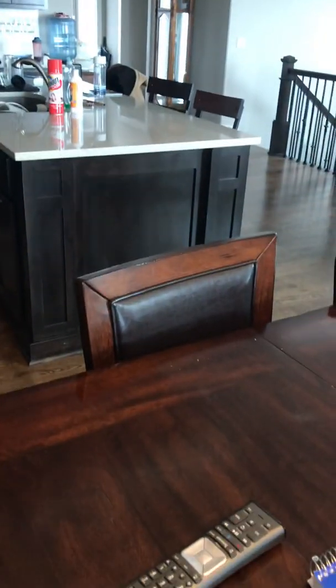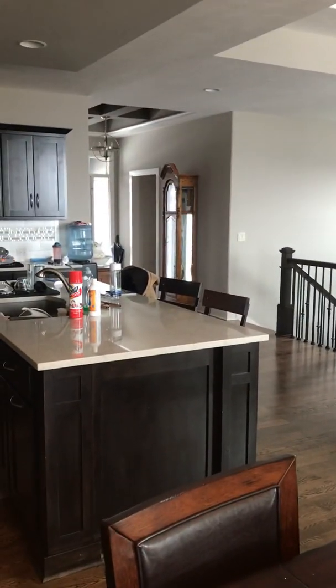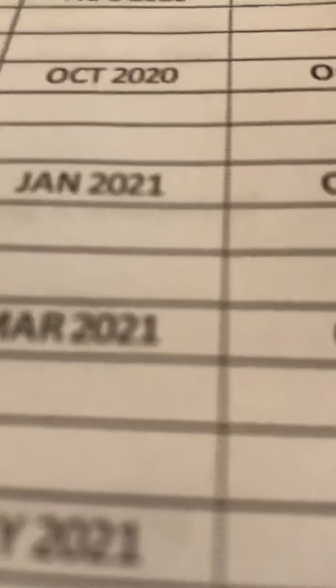I've already got everything cleaned up, but I'll show you that's where I did it with the stainless steel. Trash can is right there below the counter. Around the corner through that doorway is the bathroom and the shower with the sink. Another sink. Fire extinguisher was up there. I did use my safety glasses and my gloves.